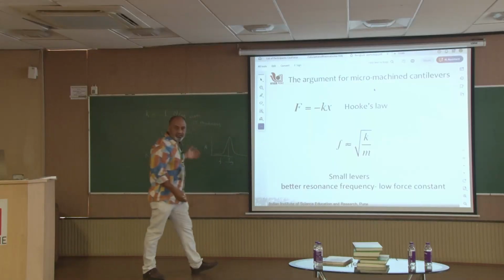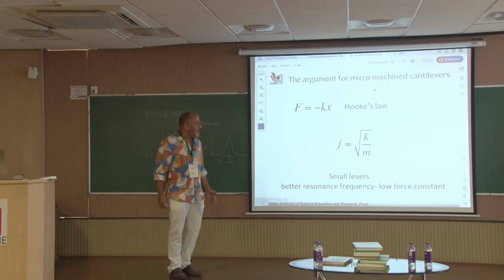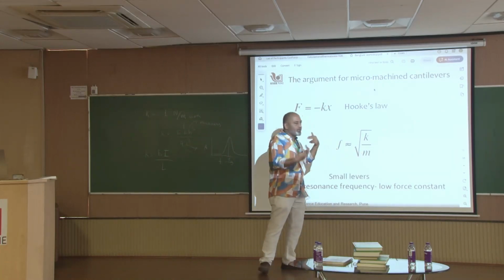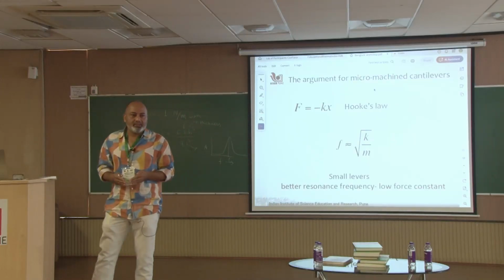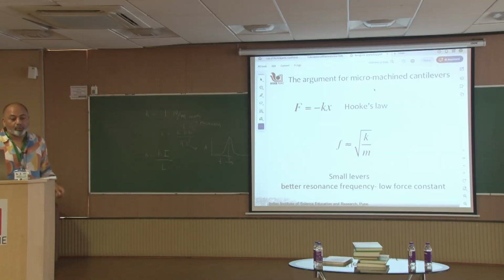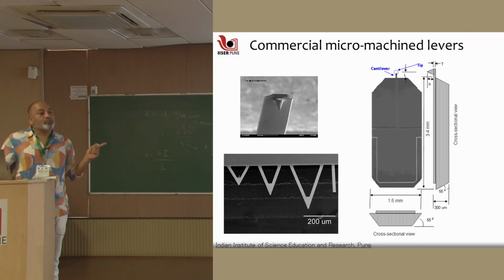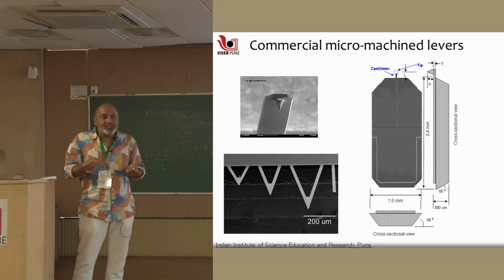The mass has to be more, a longer and longer cantilever, and at the same time if the mass becomes too much, it also becomes slow. So, you need a cantilever that is small in mass, not that long, and that exactly is the problem stated in the last paragraph of this PRL paper, and they also say, but that is okay, that is not a problem, because we are just beginning to do this.